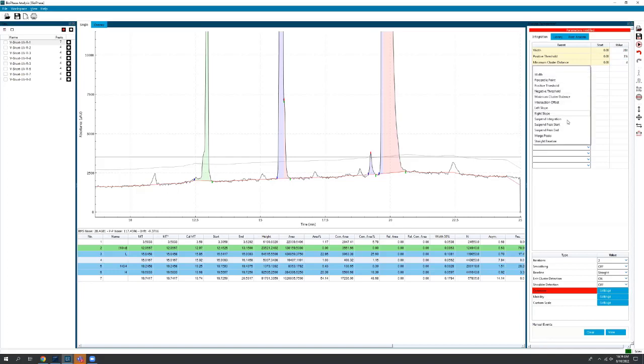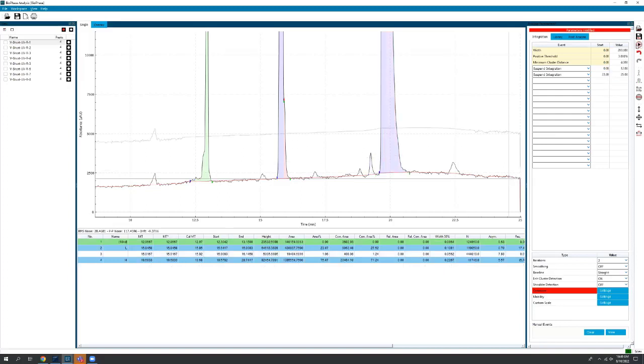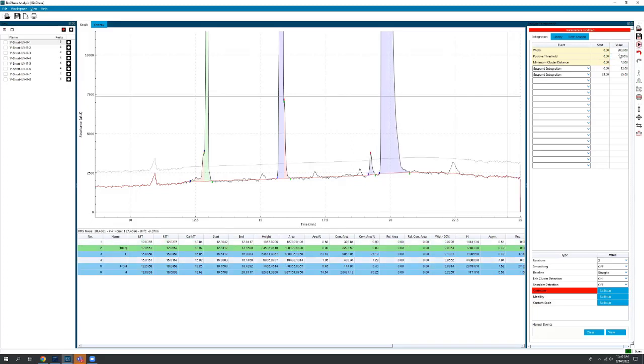And then we have some user parameters that we can enter here. So we're going to suspend the integration for the first, say, 12 minutes. We're going to suspend integration, say, for the last 2 minutes. Hit that play button, see how it goes. Positive threshold, still a little bit too high there. Bring this down a little bit.